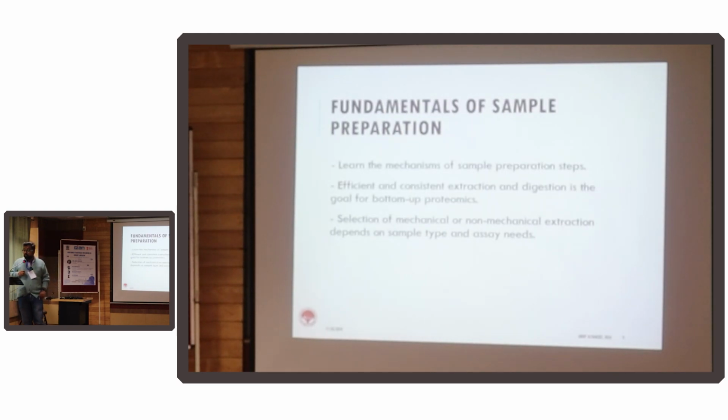So what we want to do here is learn the mechanisms that help us in preparing the samples and some efficient tools, and mostly these are for bottoms-up proteomics, which means we start with a broken protein and we try to identify the entire proteome from that. There is a top-down approach as well, but we are not going into it.